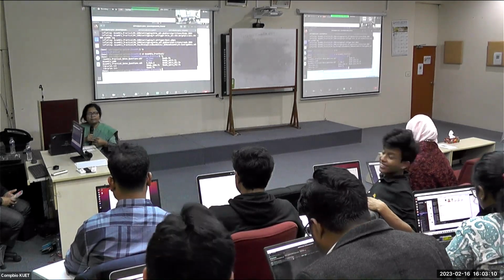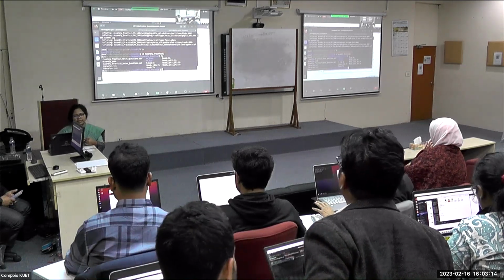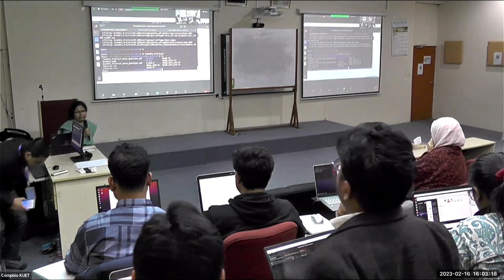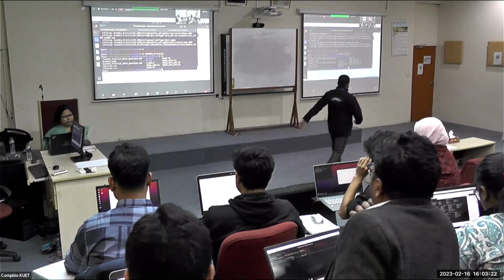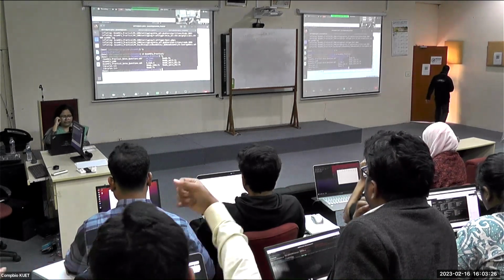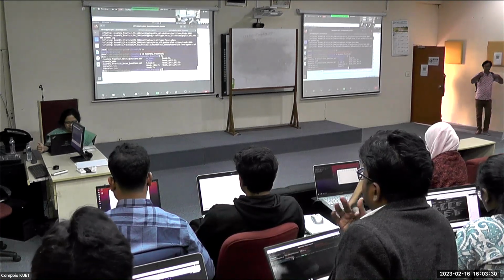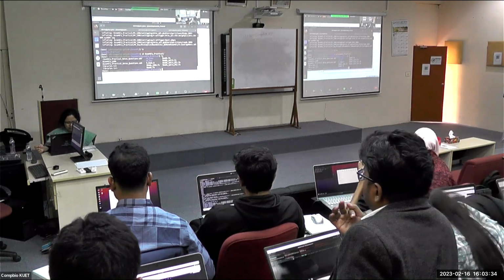This is actually from a mitochondrial genome, and we can try constructing the genome from this by doing assembly using the split.fa. So actually what I can do, okay, I can upload only the read split file.